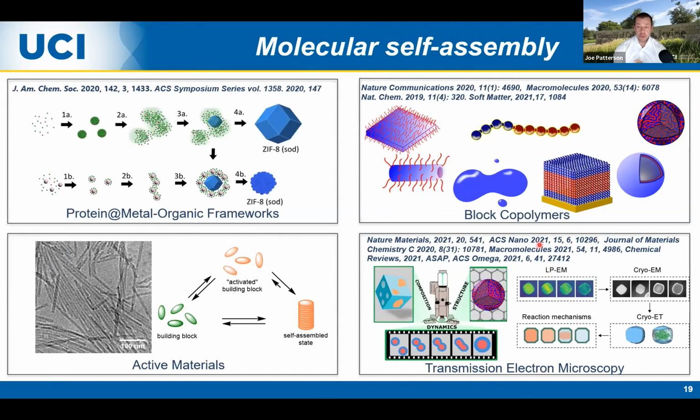So today, I really just told you about one story we have going on in my lab to do with block copolymers, but we work on many other different types of materials, and each one of them has its own story about discovering something new, testing hypotheses, and then enabling new applications. And in addition to that, my lab is really focused on improving electron microscopy as a technique, because I really believe that the more things we can look at with higher resolution, with better clarity, the more things we'll be able to discover, and that's going to lead to much more innovation in science.